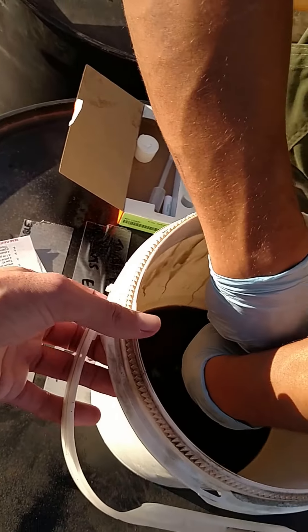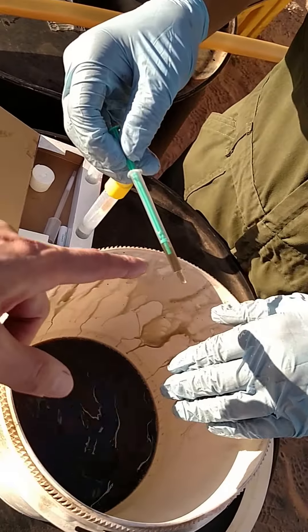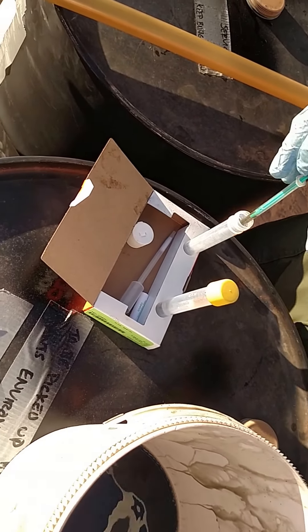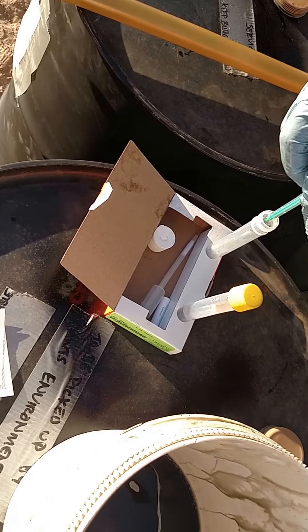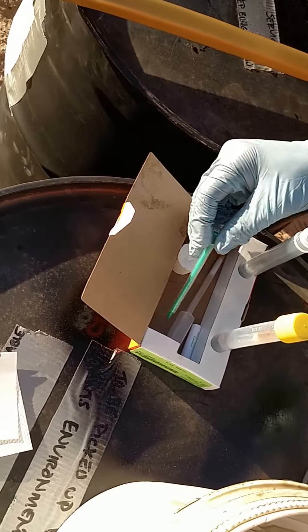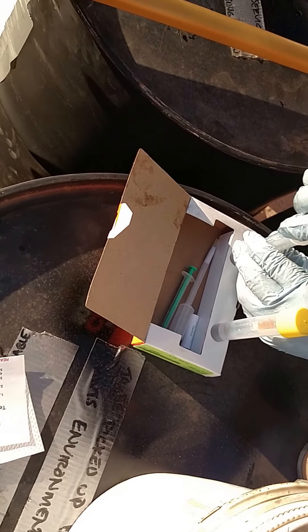Pull the syringe back slowly — see, no bubbles. That's good. Fill it to the white line, yep. And do the bottom one first.